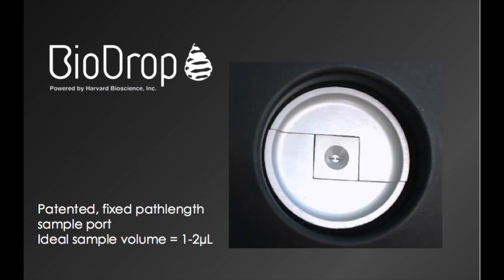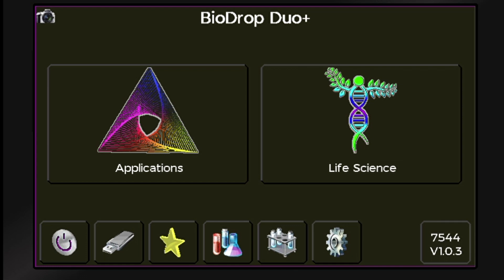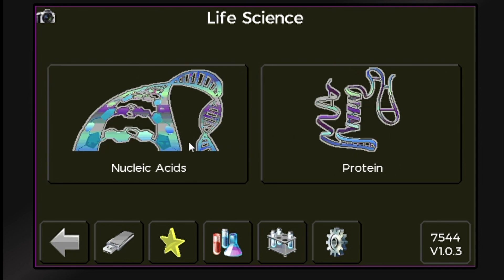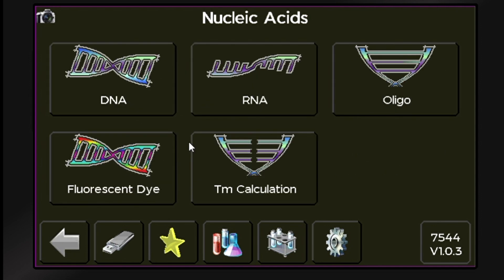The patented microvolume sample port has a fixed path length and is ideal for samples between 1 and 2 microliters. All Biodrop instruments come fully loaded with common life science applications including both nucleic acids and proteins, and both of these also include fluorescent dye applications.